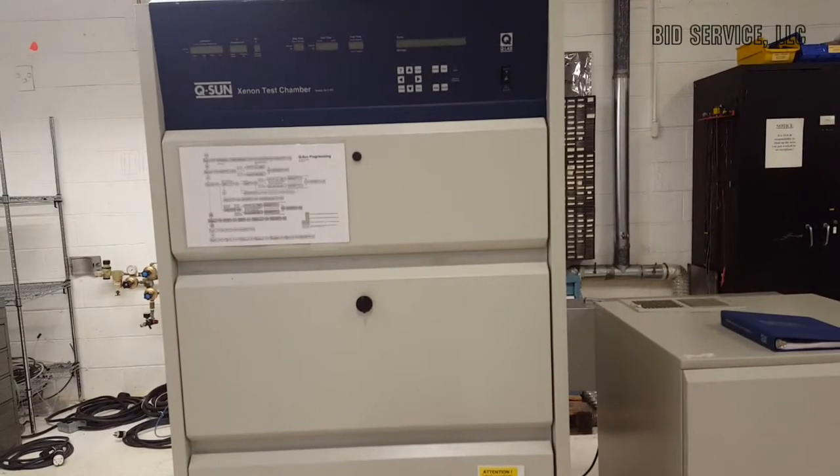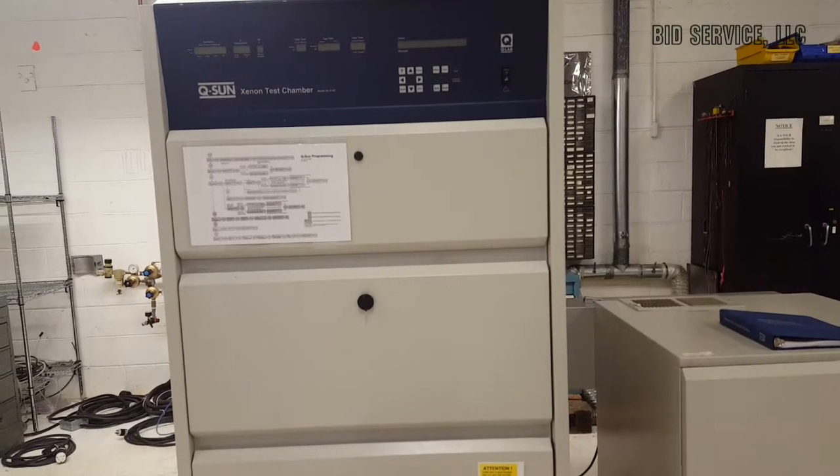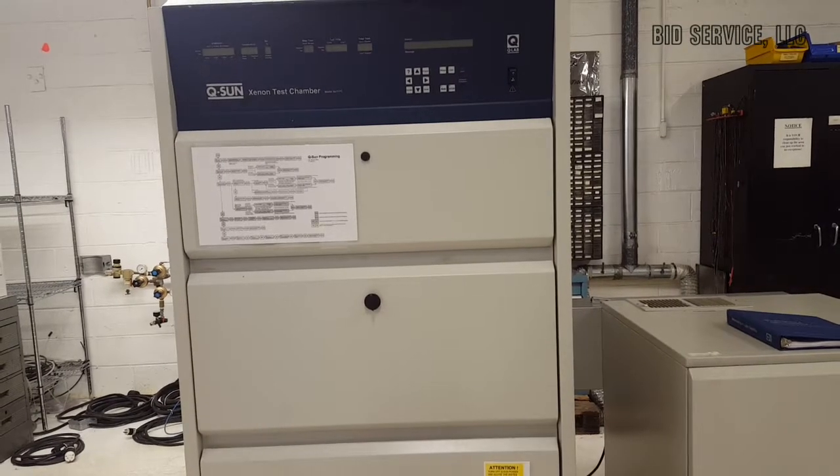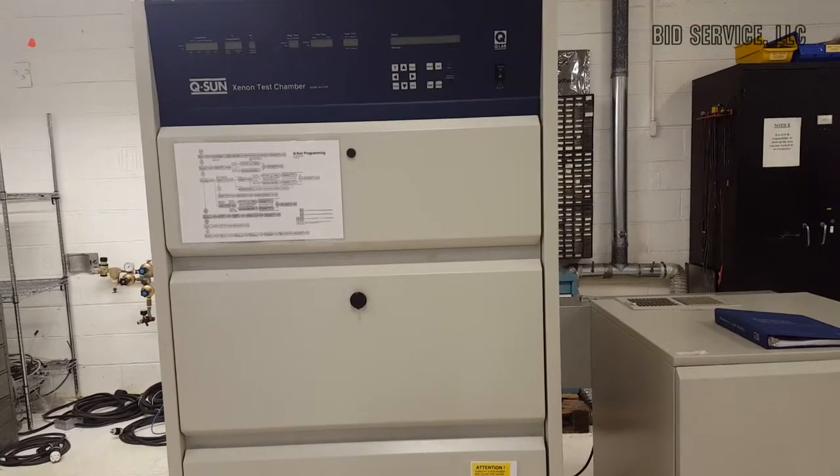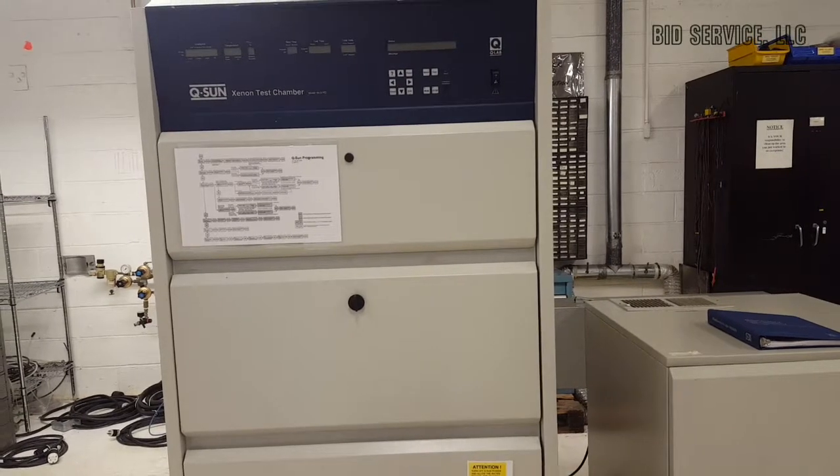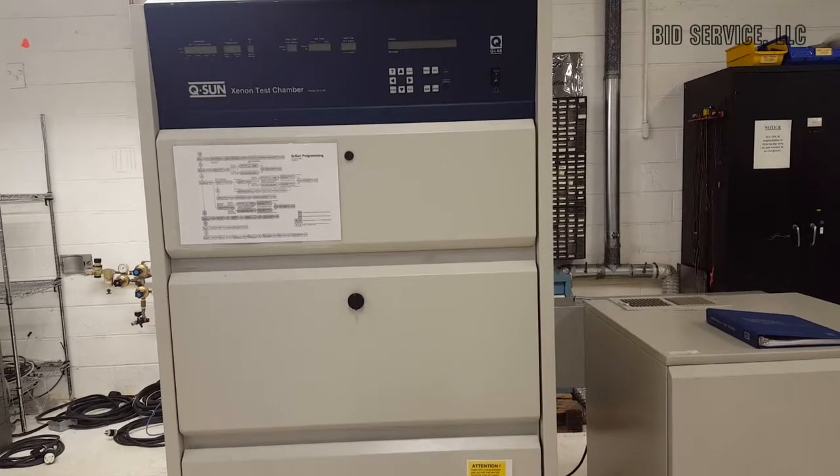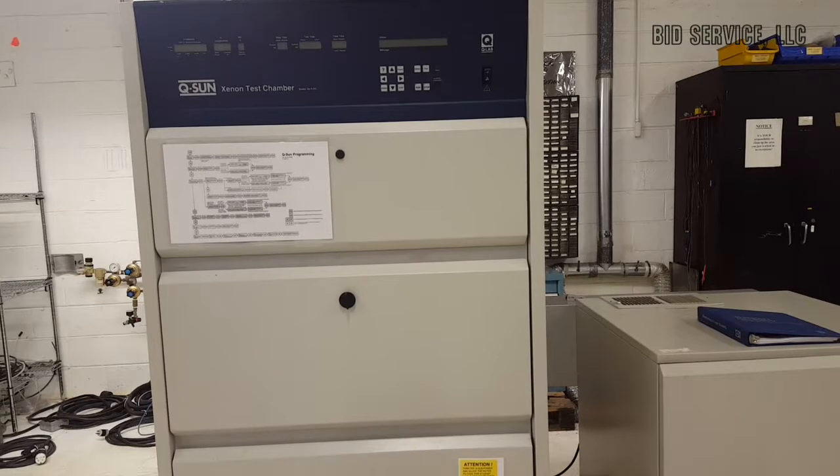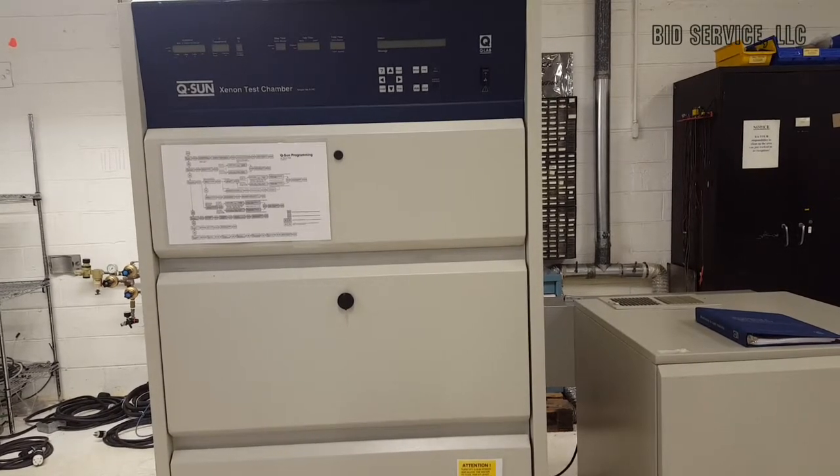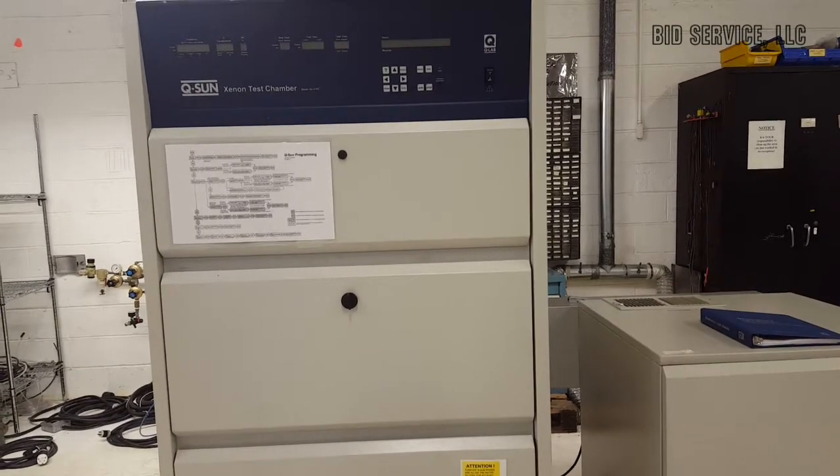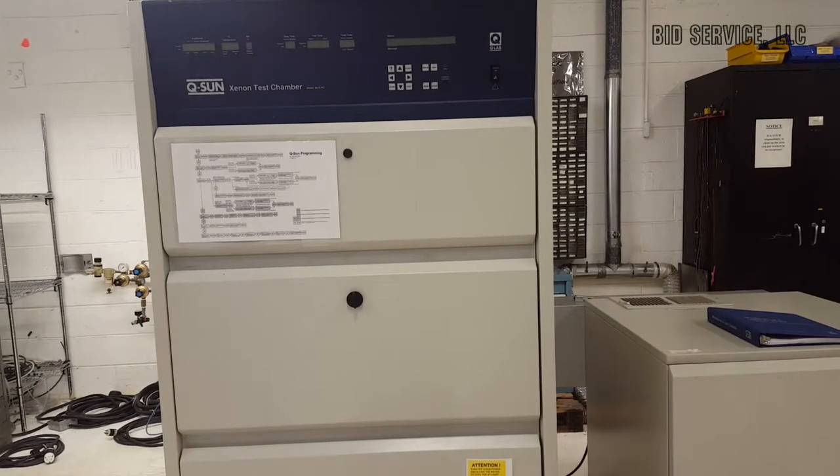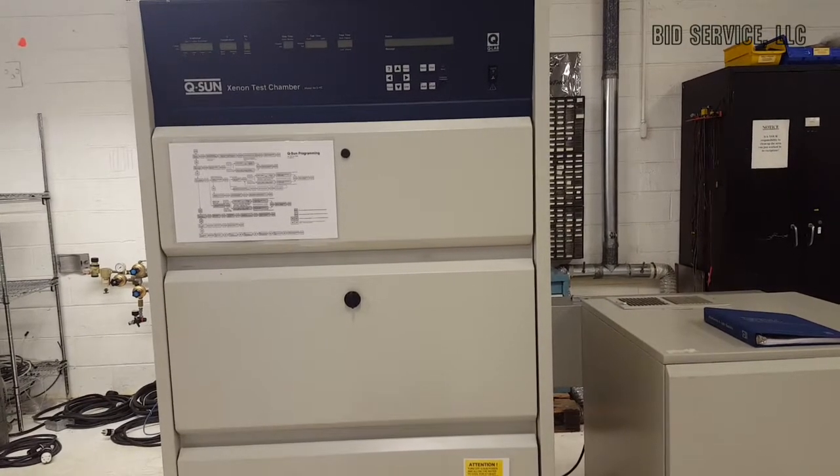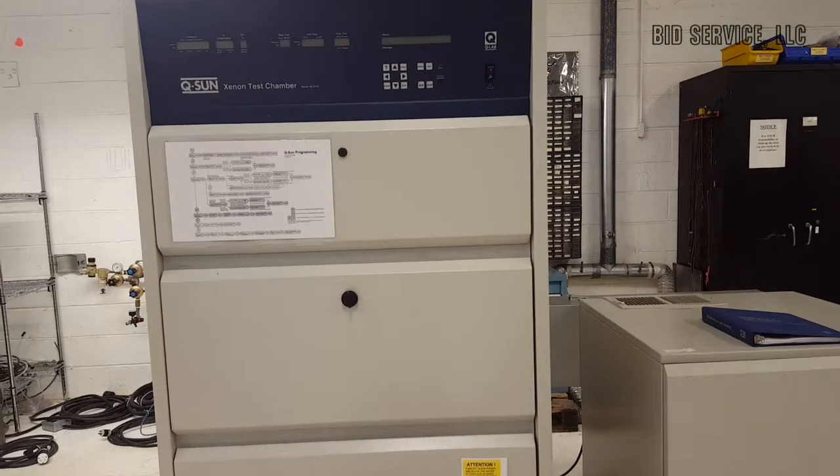It is equipped with a radiometer. The specimen tray is 17.5 inches long by 28 inches wide. It is also equipped with a separate cooling unit, and simultaneously chamber air and black panel temperature control is possible. It is powered by 208 three-phase, requiring a 44-amp service.